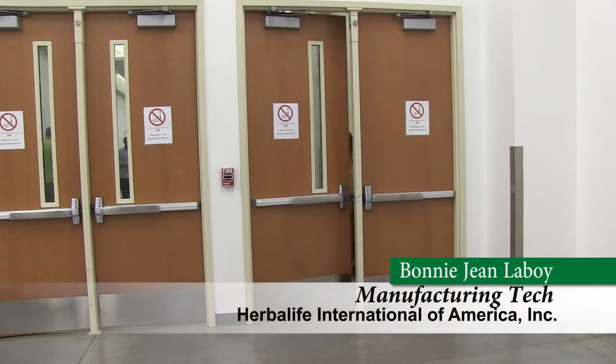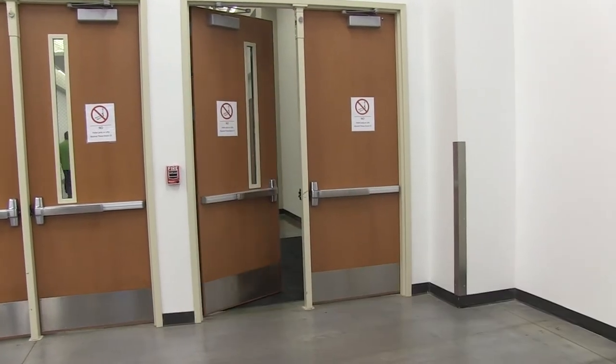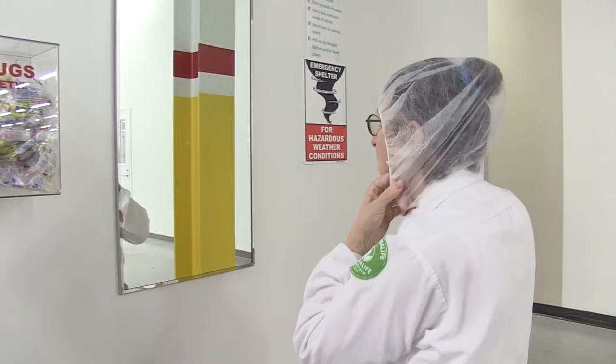Gowning begins with washing your hands. If you are coming from outside, from the restroom or from the cafeteria, hands must be washed thoroughly with antibacterial soap and warm water.